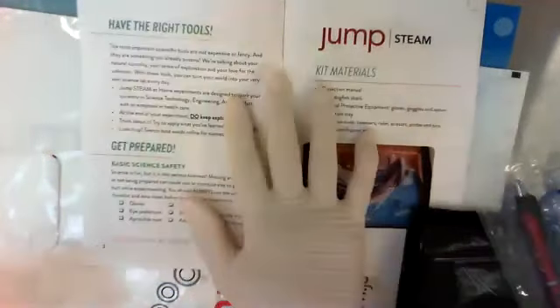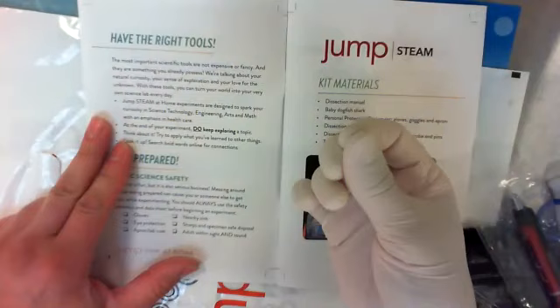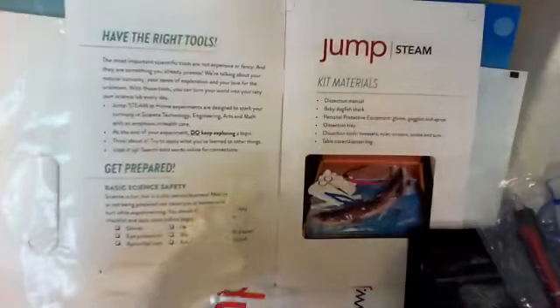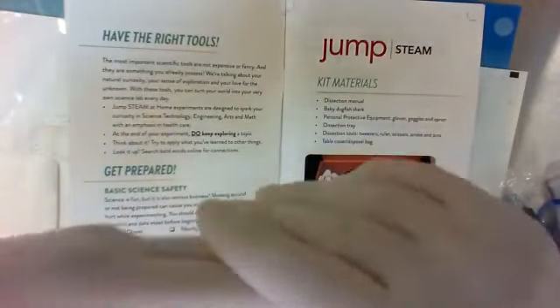It's because when you're feeling something, you want to make sure you can feel the folds or the creases. When I have you feel the skin of the shark, I want to make sure you can feel the texture of the shark. So when you put the gloves on, put them on tight. If you rip a glove, grab a Ziploc bag, or you can even grab a grocery sack or something. Grocery sacks are great because they're really thin, so you can feel really well through a grocery sack.